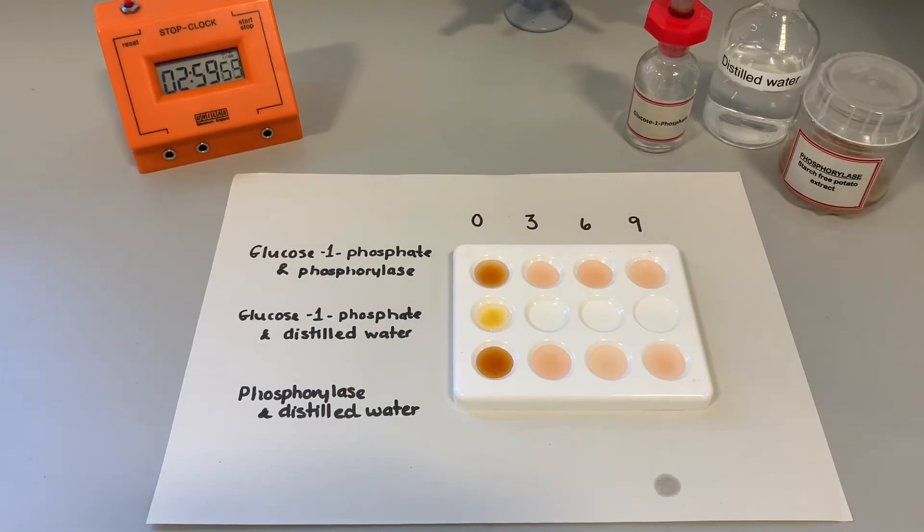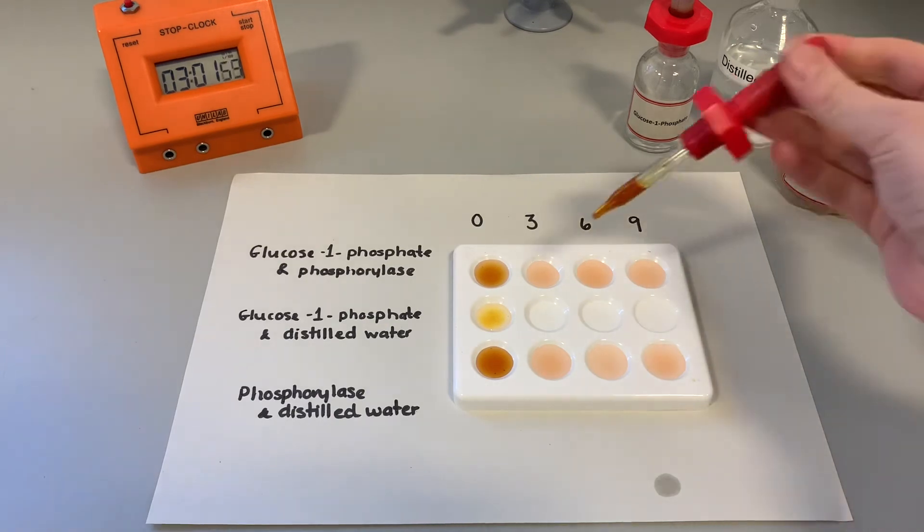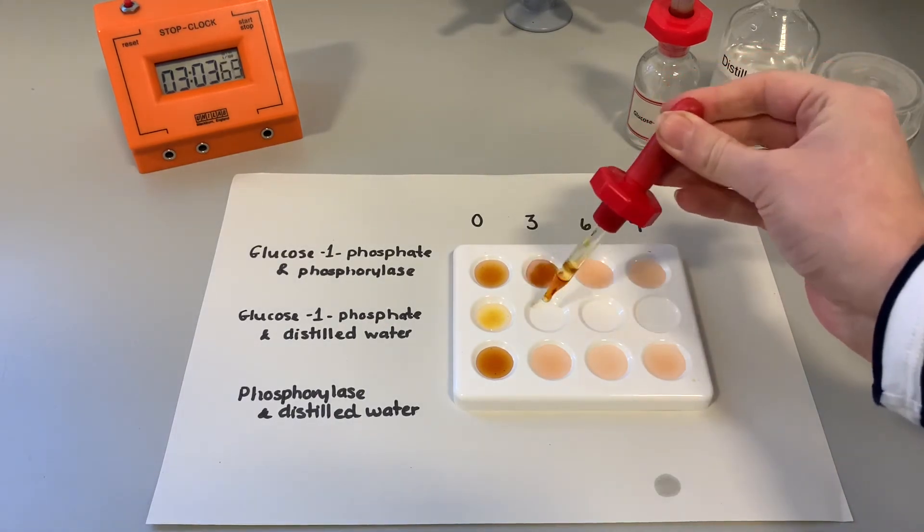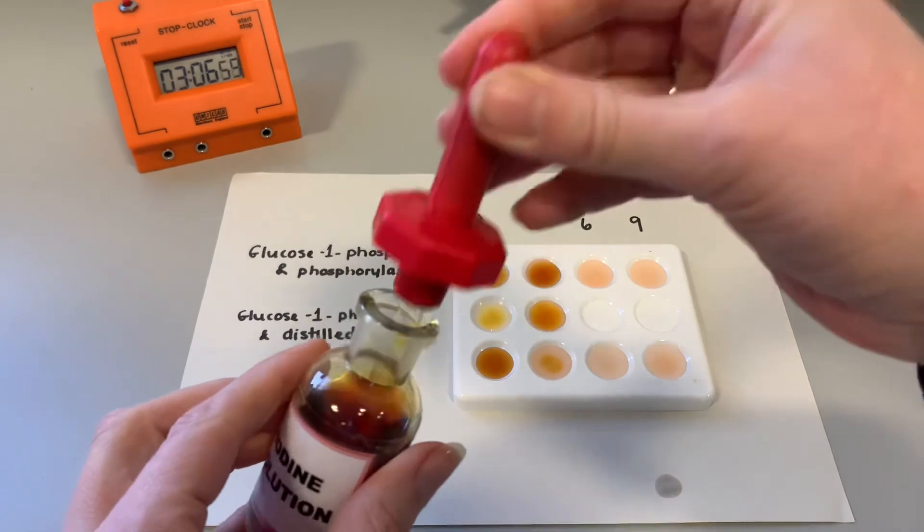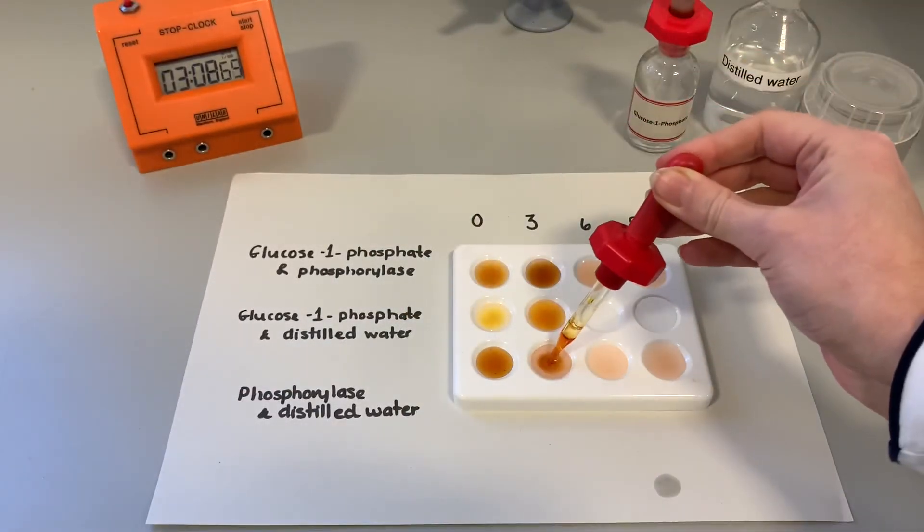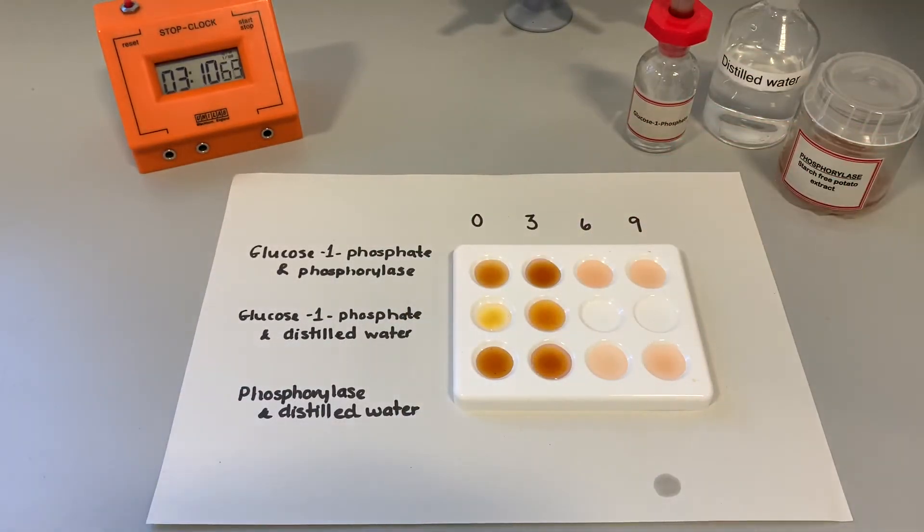So we're getting close to the three-minute mark, so we're going to add some iodine now. And again, that's three minutes. We have got no color change showing that at that point in the reaction, no starch is present.